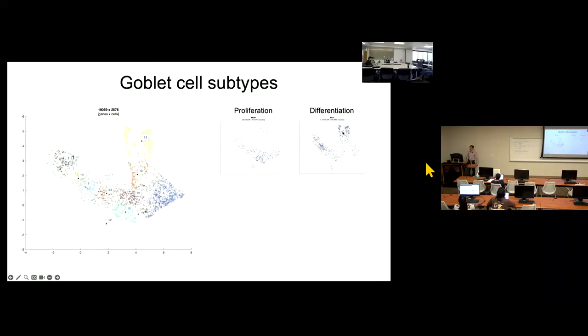Interesting. There are also differentiation markers. For goblet cells, a good differentiation marker is MXD1. I didn't do a good job of lining these up, but down here is where those proliferating goblet cells are. And this little cluster right here is secretory progenitor cells, or what I think are secretory progenitor cells. Then we have the non-canonical goblet cells here, using these 2 markers that I grabbed from that paper. So this branch right here is non-canonical goblet cells, and these over here are canonical.